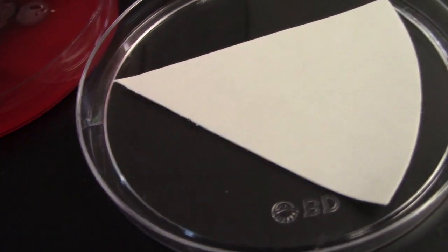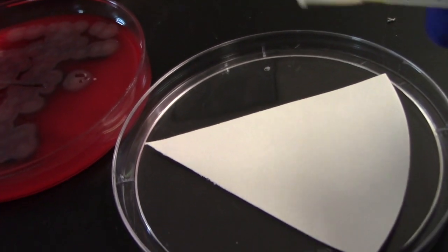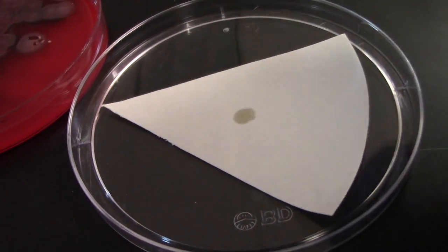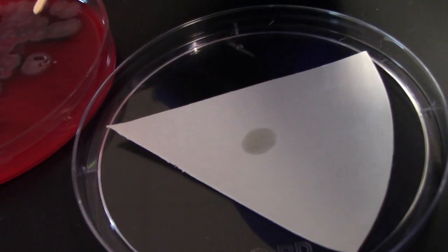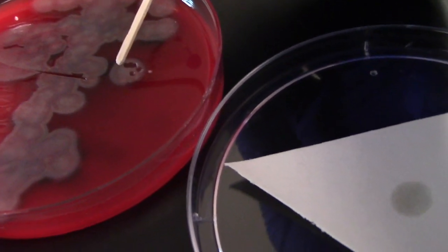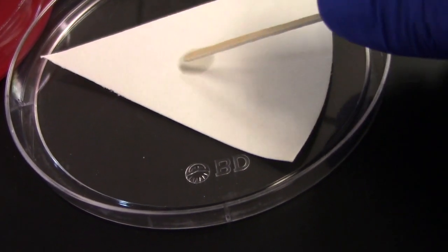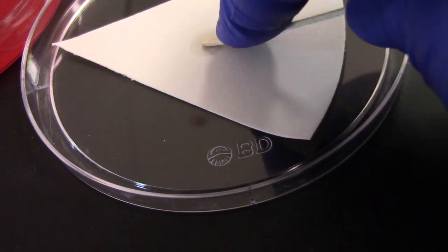We're going to test our other isolate with the same spot indole reagent. Again, on a piece of filter paper. Drop a drop of the reagent, obtain a small amount of colony with a non-sterile stick, and smear it onto the area of the drop.